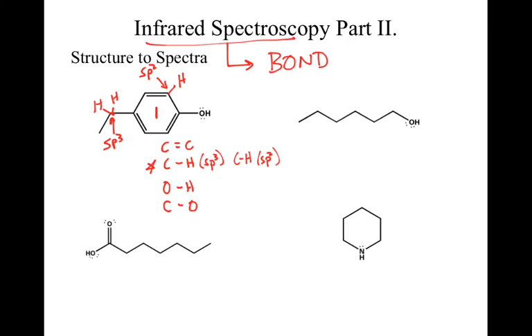That extra information is important when trying to evaluate your structure. One of the bonds that I did leave off, almost intentionally, would be a carbon-carbon single bond. This is one that you will see me never write down after this because the carbon-carbon single bond shows up in the fingerprint region. Too difficult to interpret, so don't worry about it.